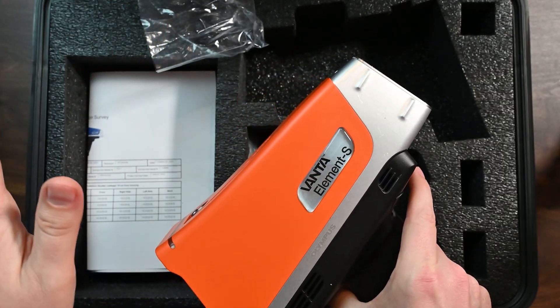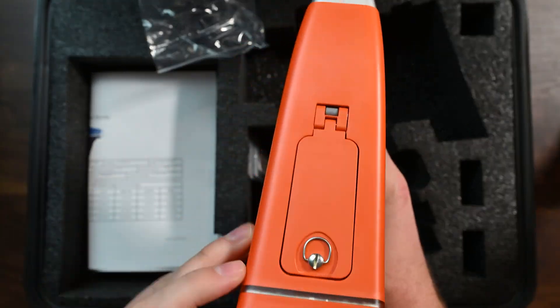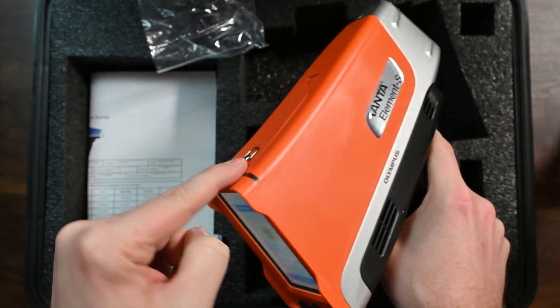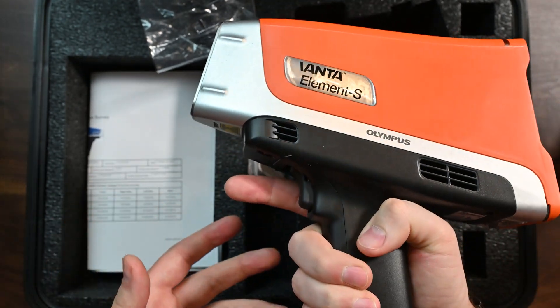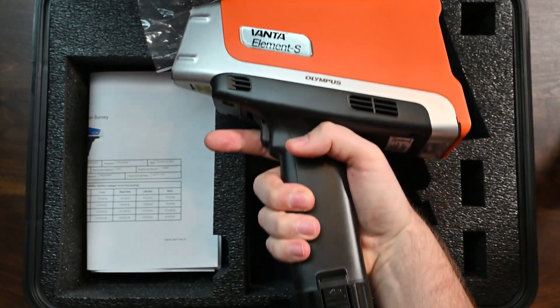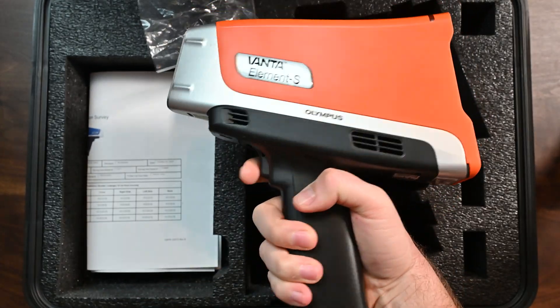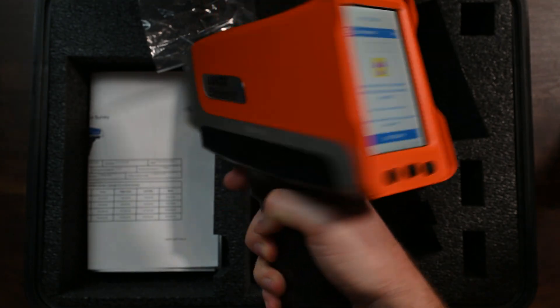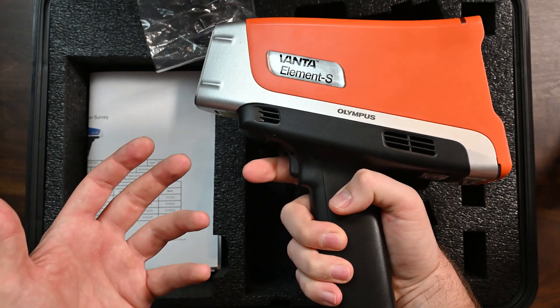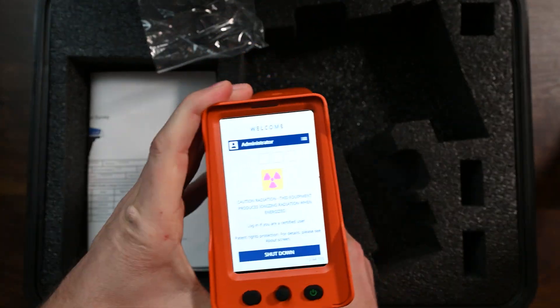Olympus is now Evident Scientific, but for the sake of this video we're going to call them Olympus. We have x-ray lights here on the top of the instrument — it's like an LED panel that runs all the way around. The handle's a little bit big, a little bit bulky, but actually seems to be okay. And there's a trigger here, which I actually really like. Nice feedback on the trigger. Overall, I think this feels like a nice, beefy instrument. It feels really good to me.